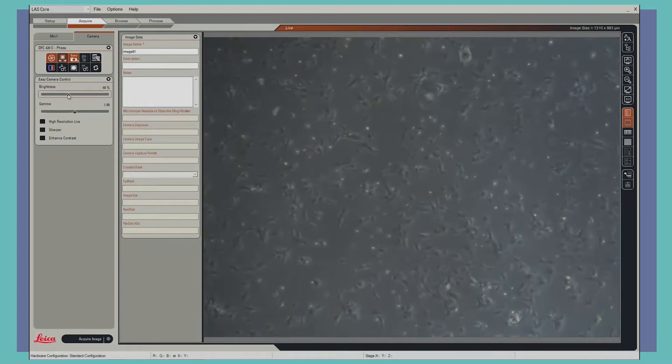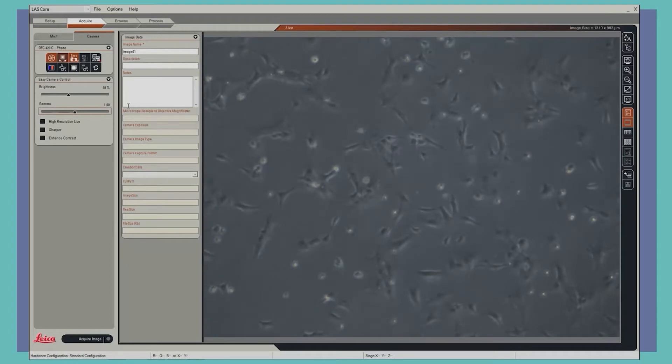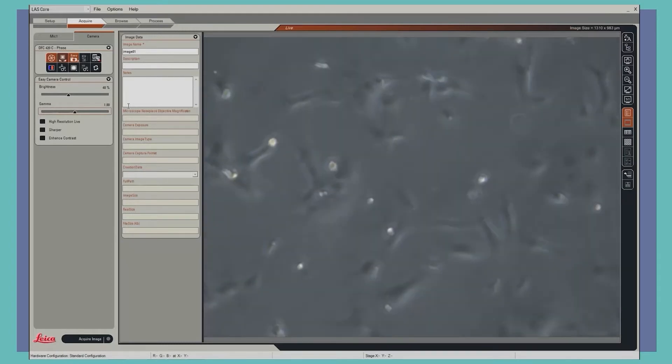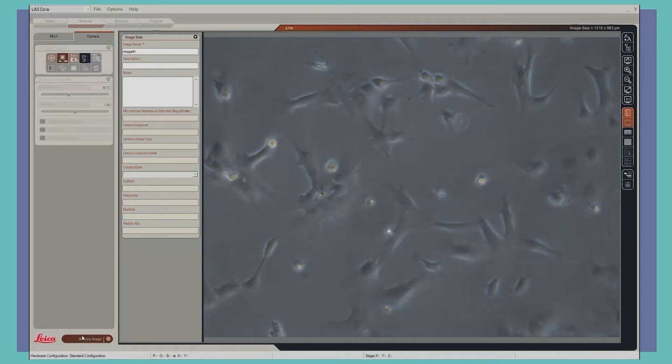It is also useful to look at different magnifications. Lower power objectives allow you to view wider fields of view. As we change magnification, the objective lenses are switching, and so we see a black screen on our live feed. Higher power magnifications can be used to study cells in more detail individually. This image is now at 20x magnification and can be captured so it can be saved to a file and viewed later.